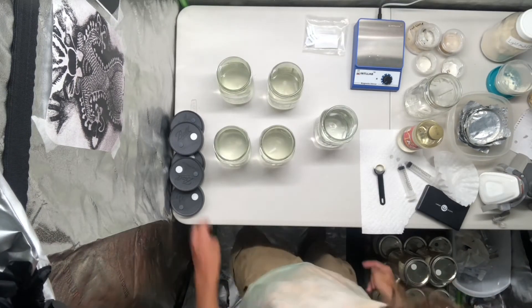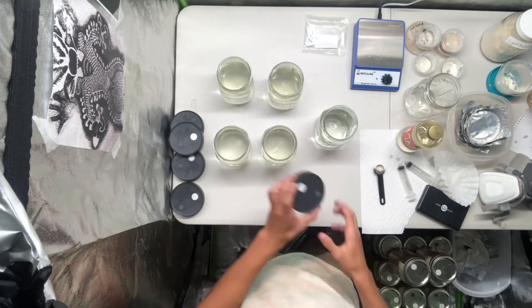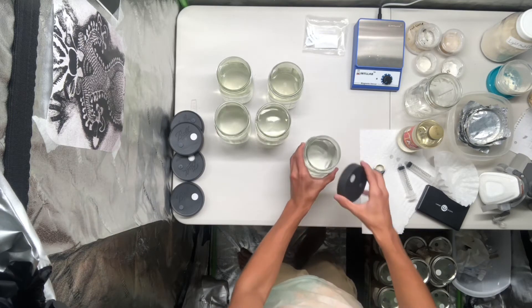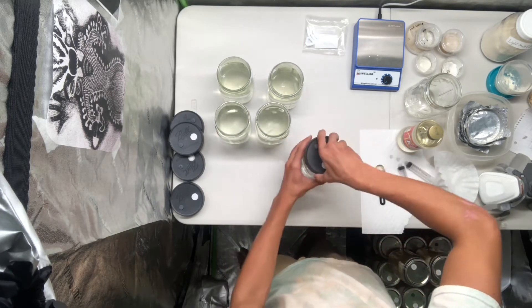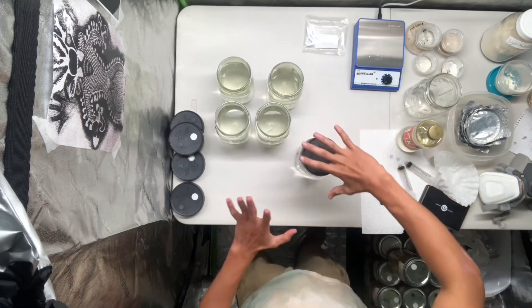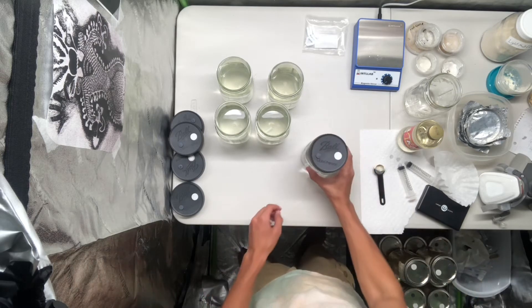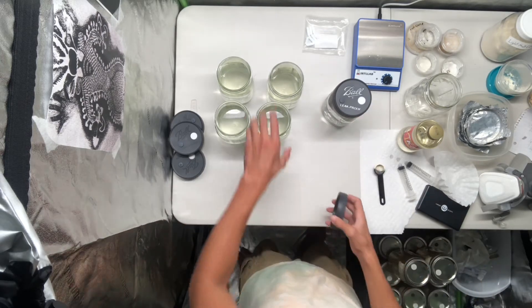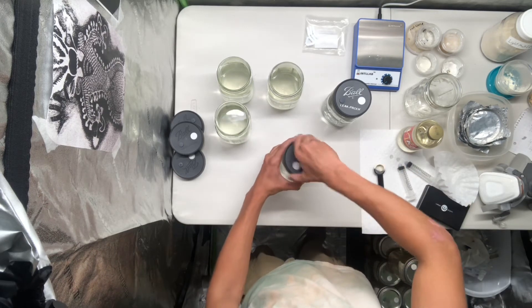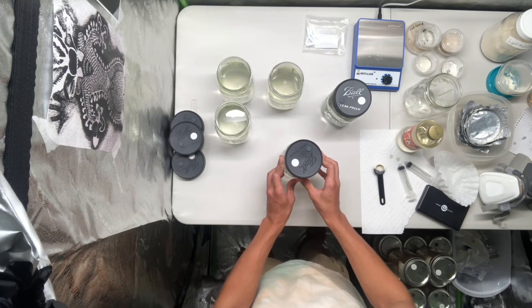Now that we've got everything decently homogenized we can add our lids, but there's a certain way I like to add the lids and it's referred to as finger tight. What you do is get the lid on and then you only spin until the jar starts moving. That ensures the lid isn't on too tight so you don't get any pressure cracks or anything like that when you put it in a high pressure environment like the pressure canner.